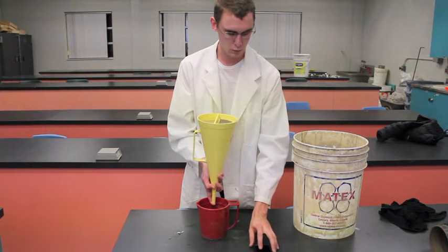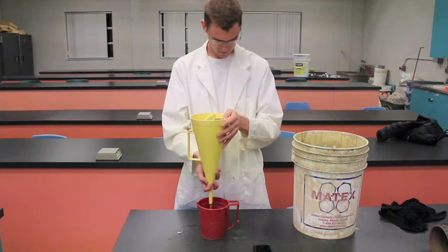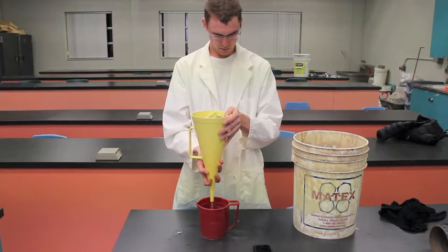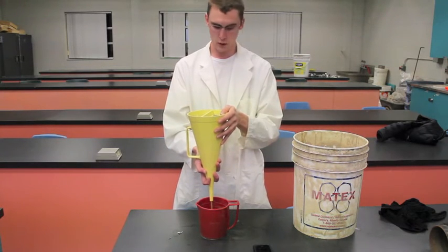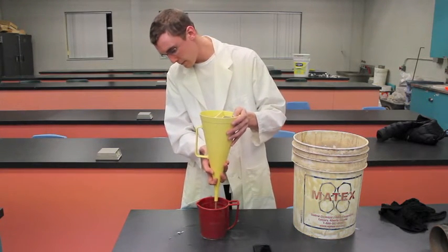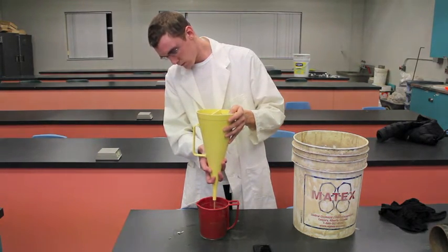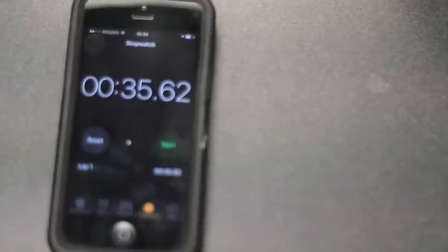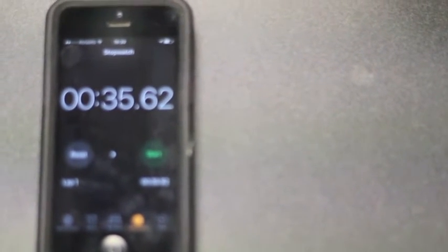So, three, two, one, go. And there we go, our mud's filling up at a decent rate. So there are our results right there. We can see that we have 35 second mud on the timer, and this falls right between our desirable limits of having 32 to 38 second mud per quart measuring cup.